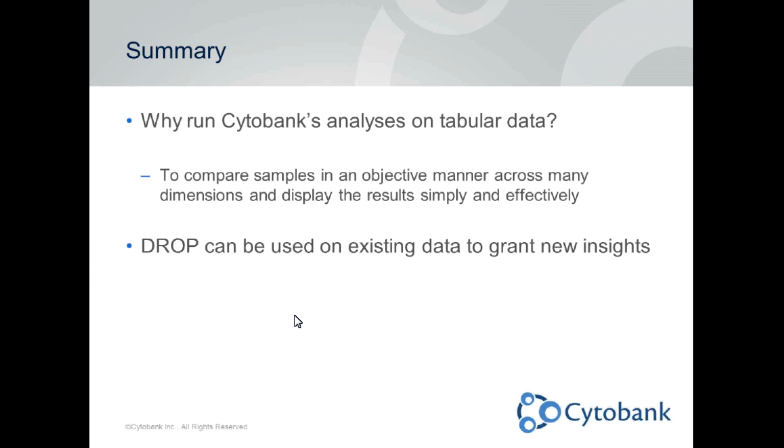That's why we put them in our software, to give people who don't have access to a computational biologist or bioinformatician access to these powerful bioinformatics tools. So we're now opening up the doors to these other data types, so you can use these algorithms on other data that you work with, and it can also be used on existing data.